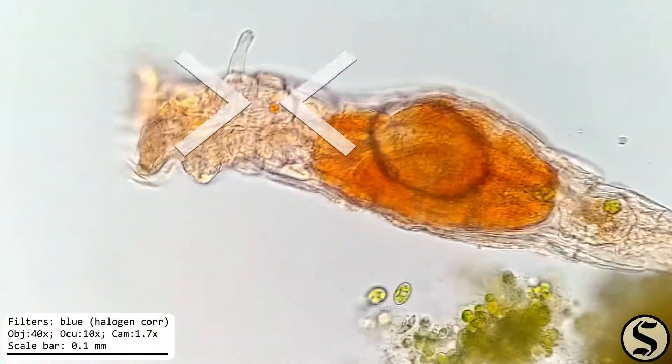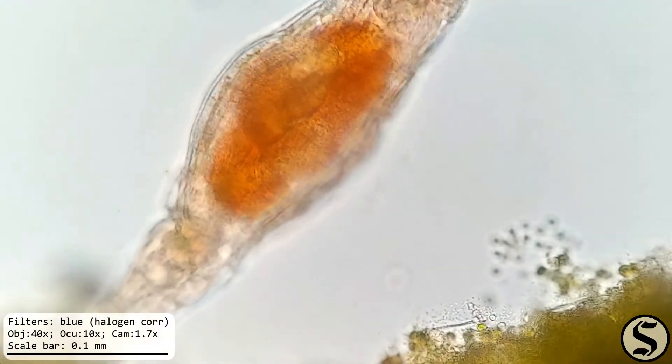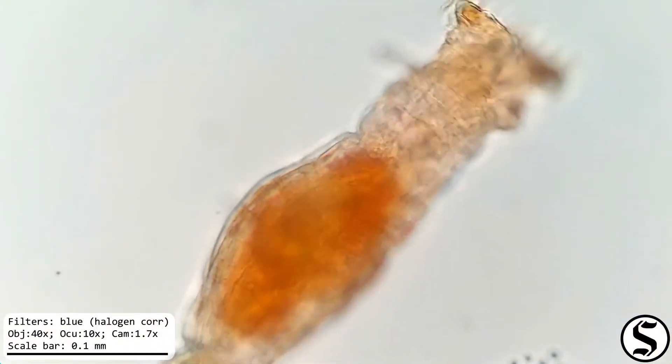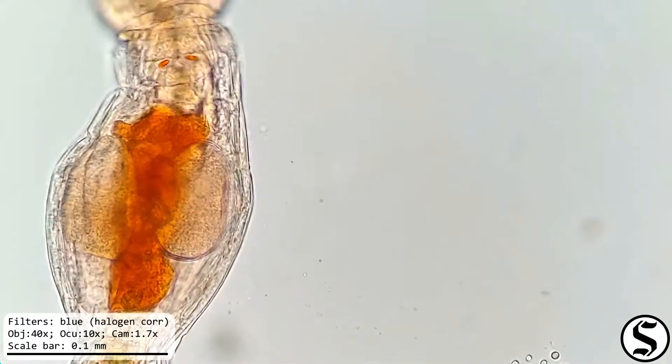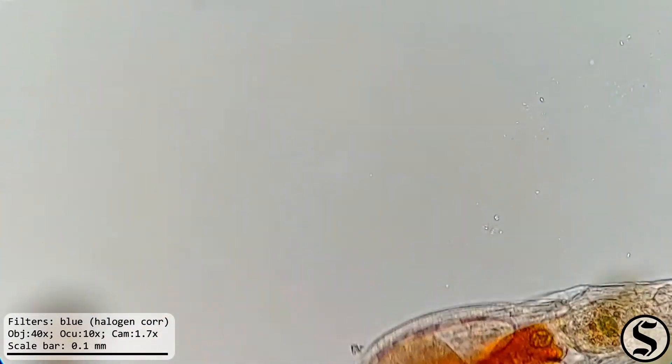And we can see from the orange eye spots on its brain whether or not it wants to hold still that this is of the genus Phyllodina. It really didn't want to hold still.